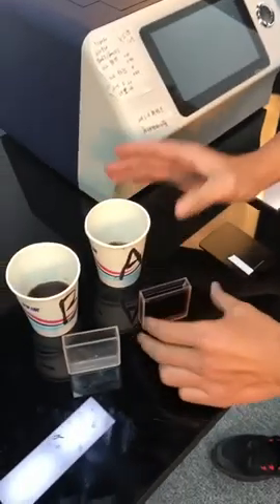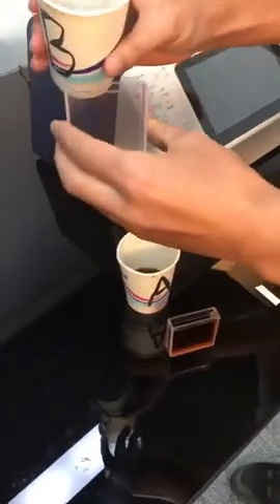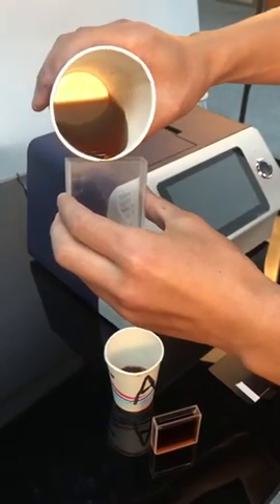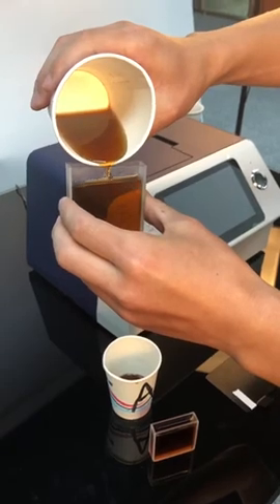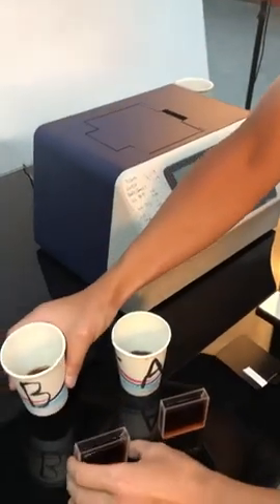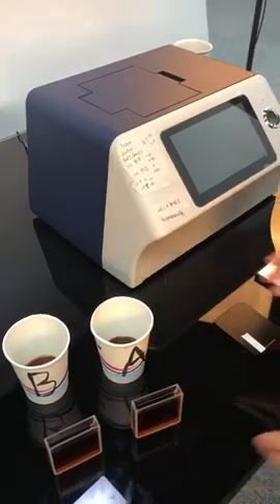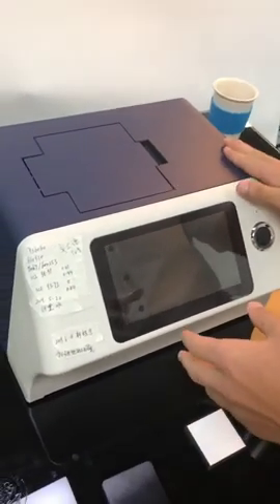Don't spill the liquid out. Let's turn the spectrophotometer on.